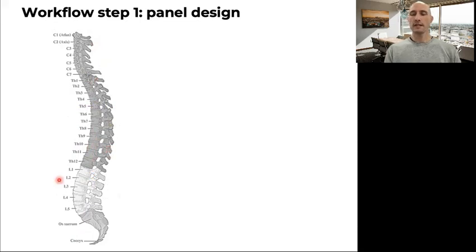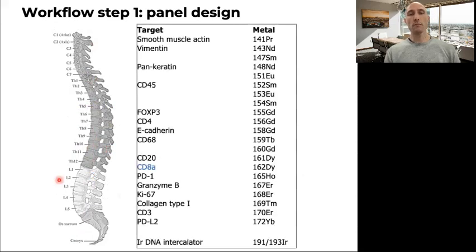This is only a figure, but our backbone panel is this one. So regardless of the project we are working with, we always work with the same backbone, which is this one in here. This is actually a panel in which we have 3 different sets of markers. We have architectural markers like SMA or like Vimentin.